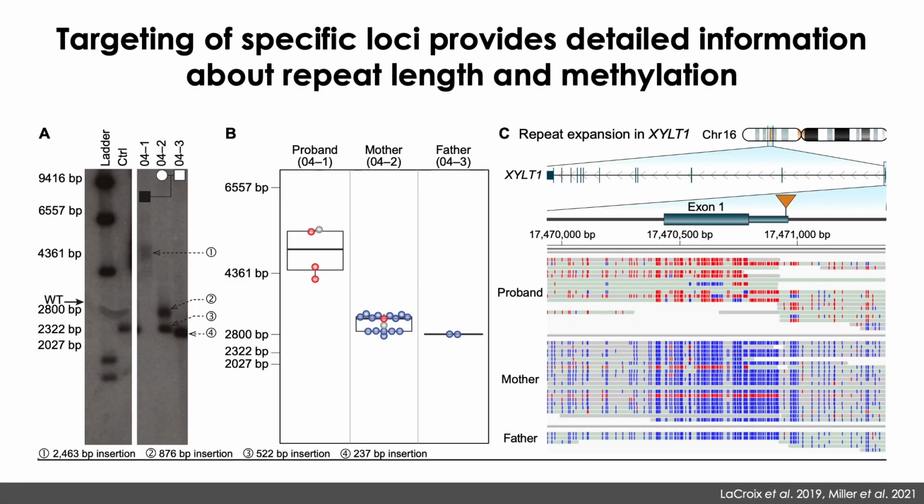So again, we used blood-derived DNA in this case. And actually, now that I see this, I think the dad was saliva-derived DNA. But you can see on that plot in the proband, we see an expansion of the target region. In mom, we see a separation of the premutation allele and the wild type allele. And then in dad, we get very few reads.